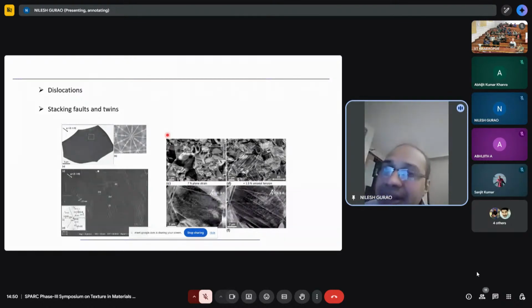But now let us come down to quantitative. Once I give you a sample, where will you do EBSD? If I give you a rolled sheet, where will you do EBSD? We know that EBSD we do on the surface, right? A rolled sheet has ND, RD, TD, right? What is ND, RD, TD?